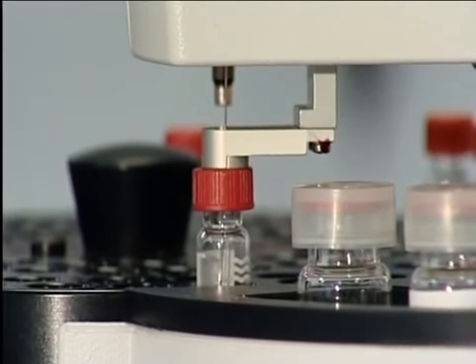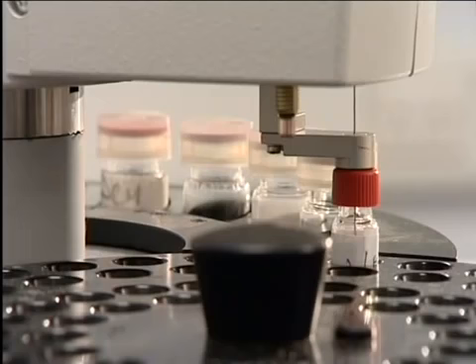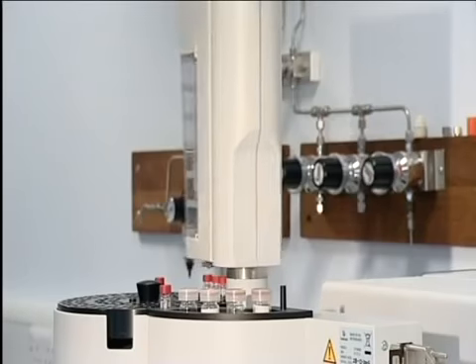This GCMS instrument has an auto-changer for the samples. Many samples can be loaded up and run automatically, perhaps overnight.